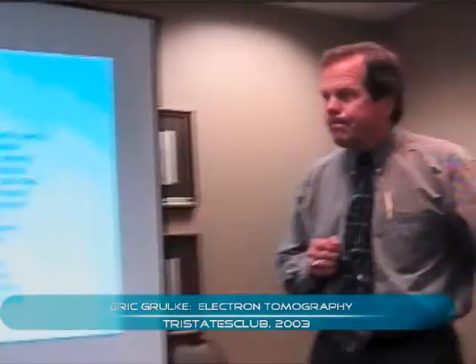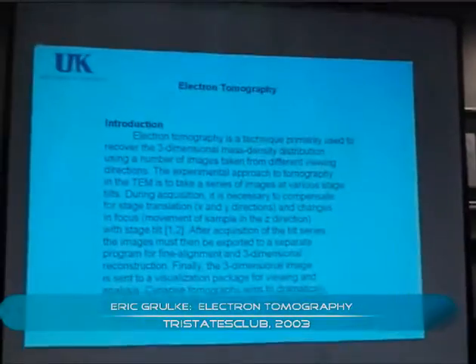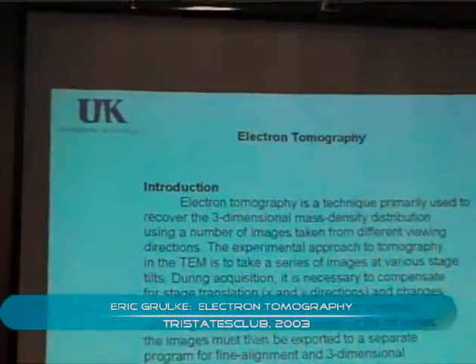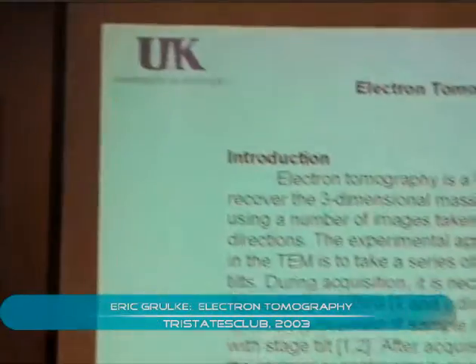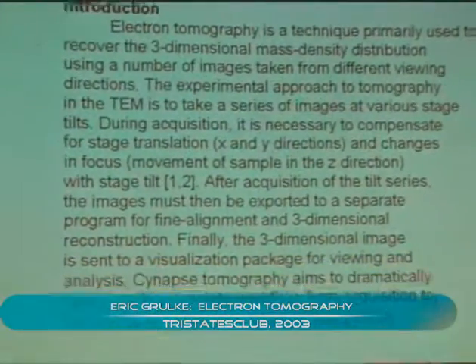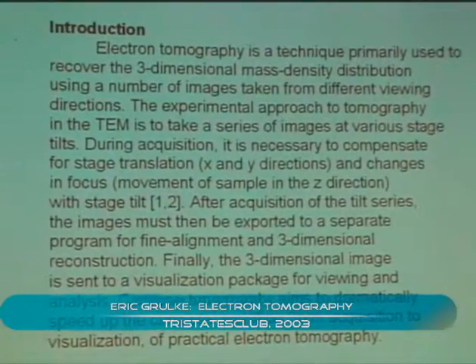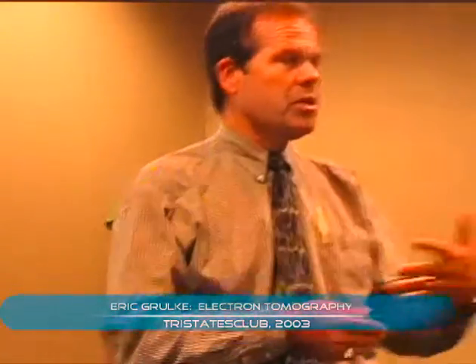Yes. There is some new software which was just announced in April, end of April this year, in which you can control TEM imaging so that you can do a series of scans and scan through the material, save those images, and then you've got a 3D representation, if you can then connect splines and so forth.